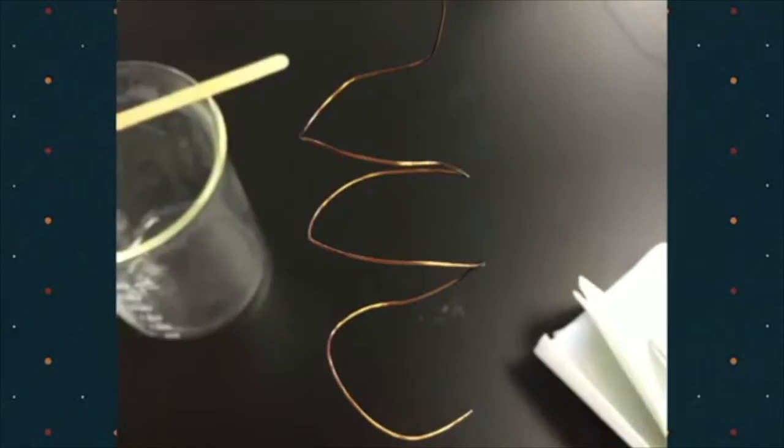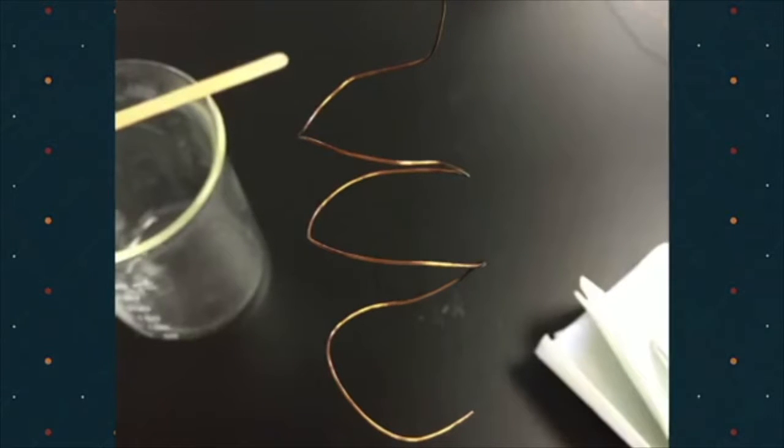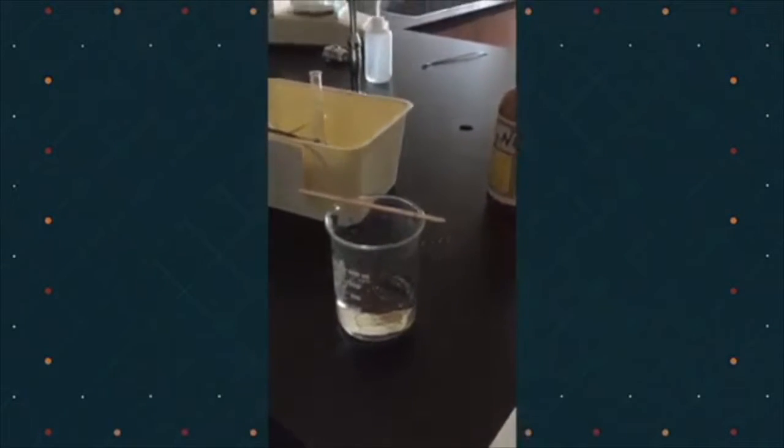First, use sandpaper and scrape the copper wire until the bronze color is gone. The experiment won't work if you skip this step. Second, wrap the wire around your finger and make a spiral. Then put the copper wire into the beaker with at least 150 milliliters of silver nitrate. Wait for 10 minutes and you'll see silver crystals being made.